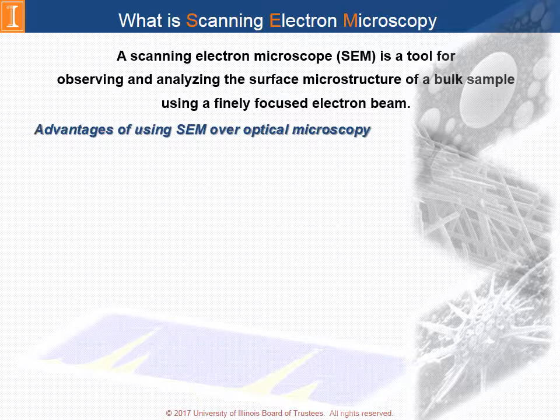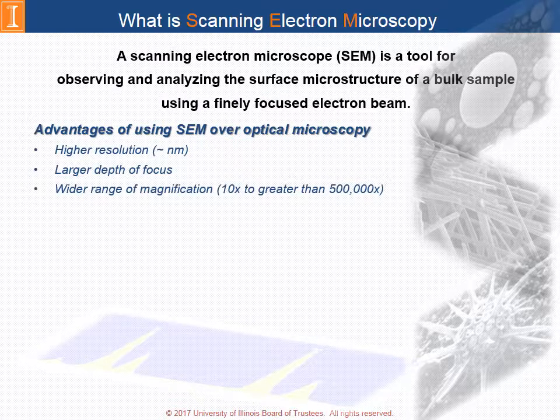The advantages of using SEM over optical microscopes include higher resolution. The resolution in SEM can reach nanometer range or even better. It has larger depth of focus and a wider range of magnifications.